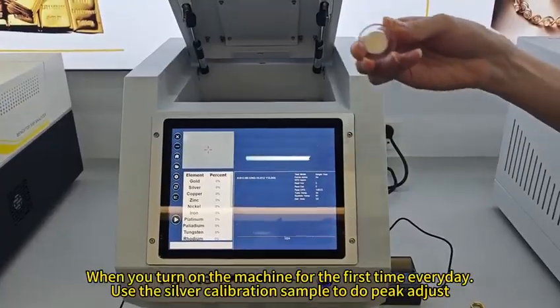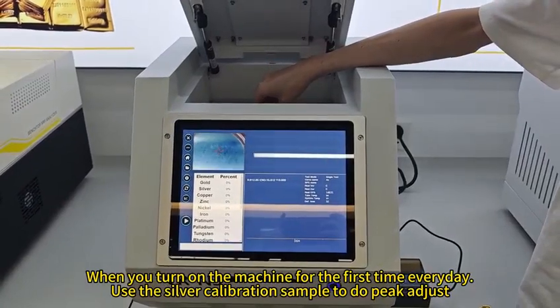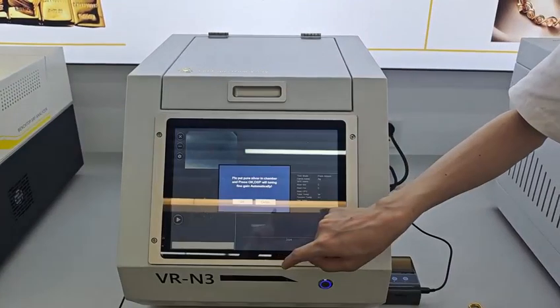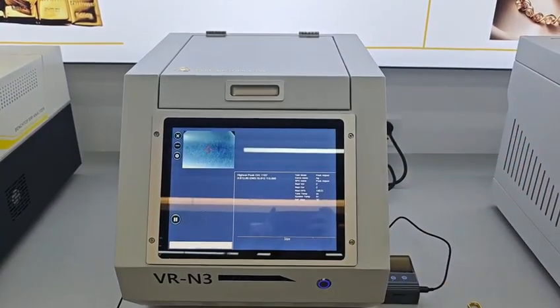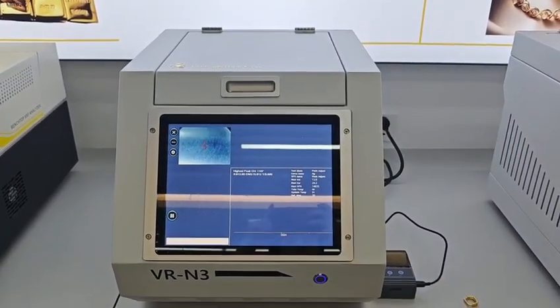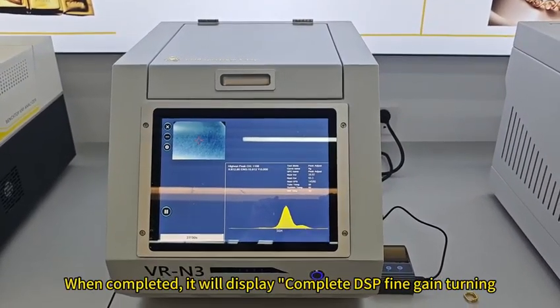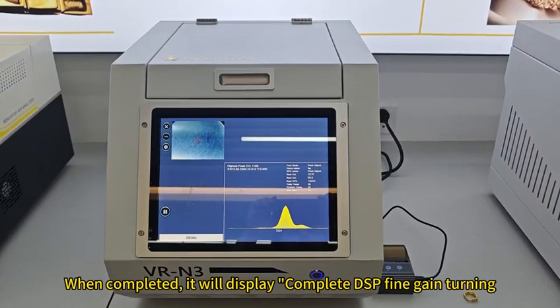When you turn on the machine for the first time every day, use the silver calibration sample to do peak adjust. When completed, it will display 'Complete DSB fine-gain tuning.'